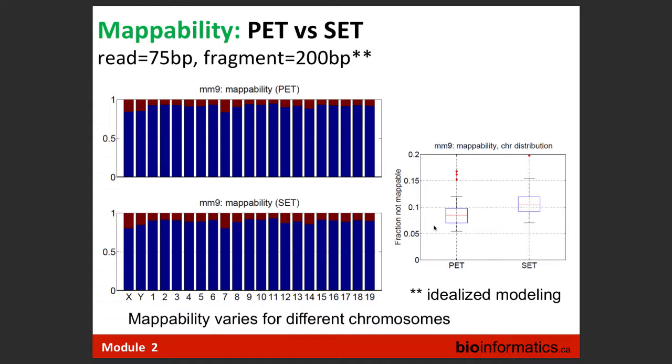Now, this is for reads of, let's say, 75 base pairs. When we go to 100, it doesn't help that much. 150 doesn't help that much. In order to really have the next significant step in mappability, we would need to sequence something like 350 bases. The reason is that in the mammalian genome we have lots of Alu repeats, which are about 300 bases. So we shouldn't be that greedy when deciding between 75 or 100. They're almost equally okay, almost the same.